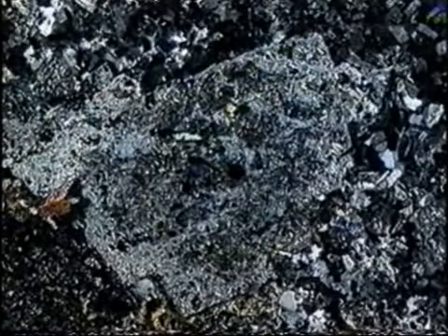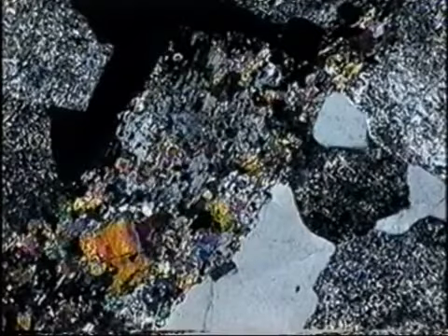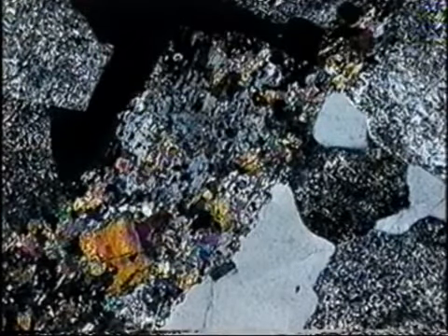Saussurite is a common alteration of calcic plagioclase and is very fine-grained and a mineral mixture containing some epidote minerals. Another example of saussuritized plagioclase. And this is an epidotized pseudomorph of a plagioclase lath.